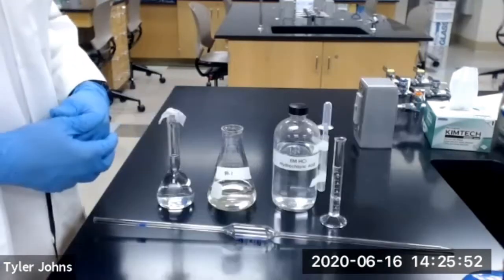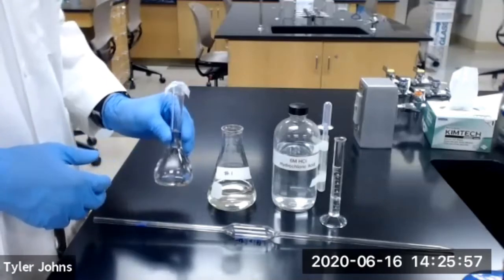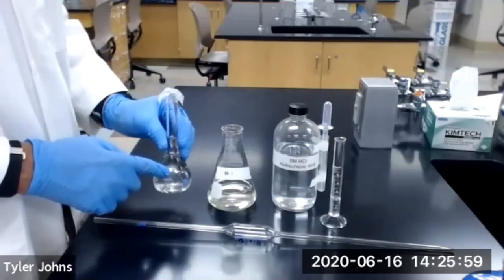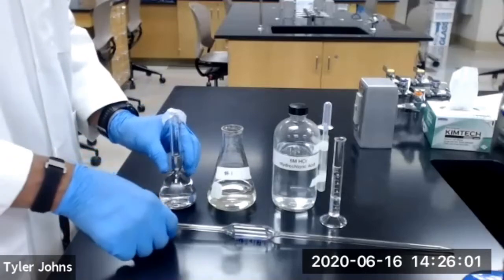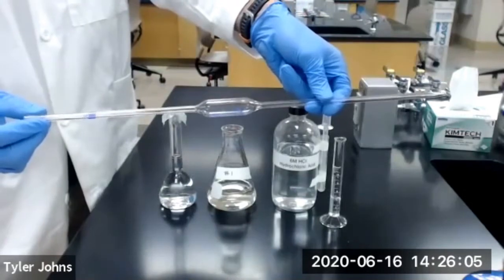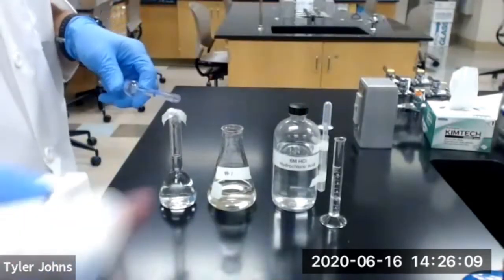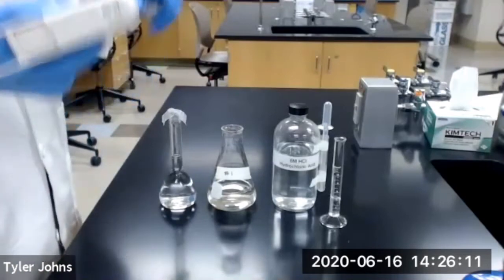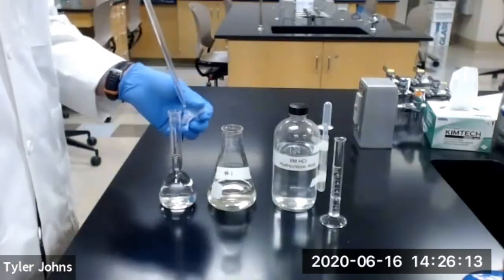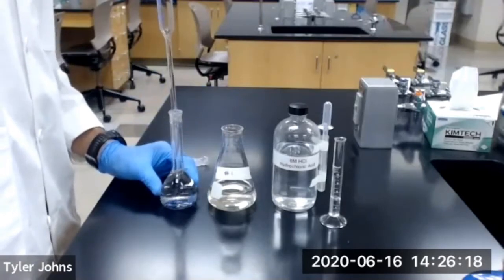We're now going to transfer 25 milliliters of our diluted bleach solution in our 100 ml volumetric flask using an analytical pipette. So this is our 25 milliliter analytical pipette or volumetric pipette. And we're going to transfer 25 milliliters of our diluted bleach solution.